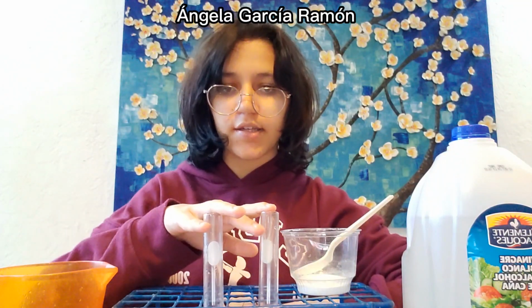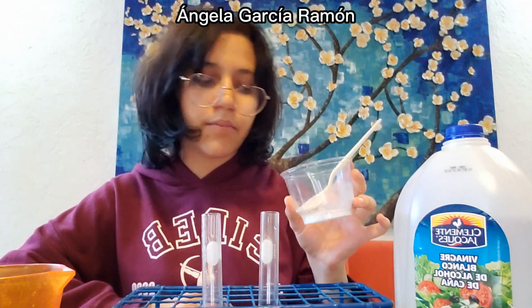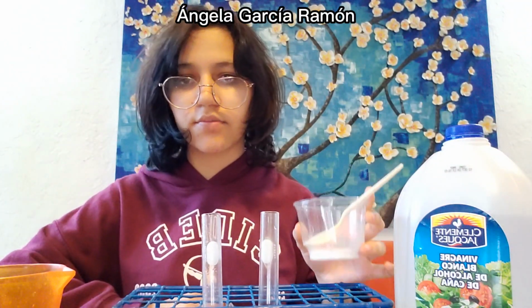The materials for this experiment are a measuring cup, 2 test tubes, a spoon, and a test tube holder. And as mentioned before, the reactants of this experiment are 25 milliliters of lime juice, 25 milliliters of vinegar, and a spoon for each one of them of sodium bicarbonate.